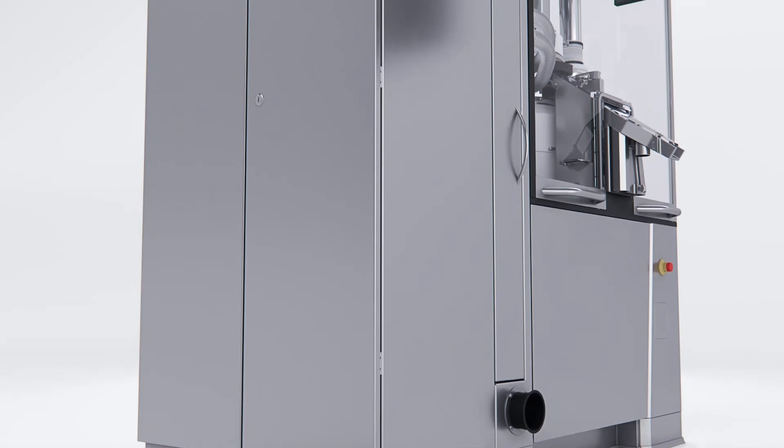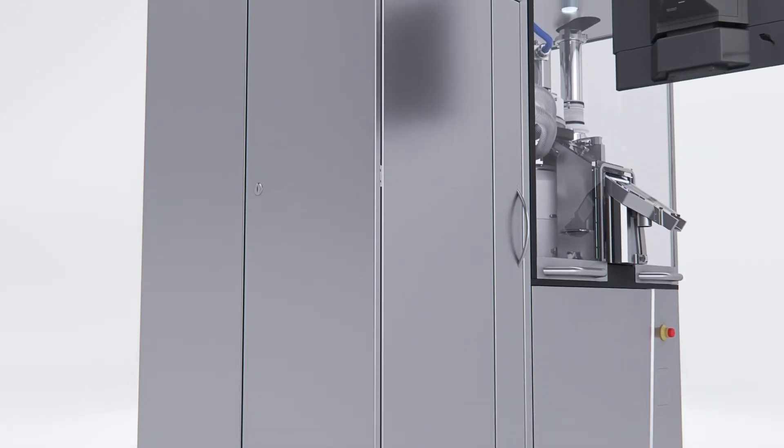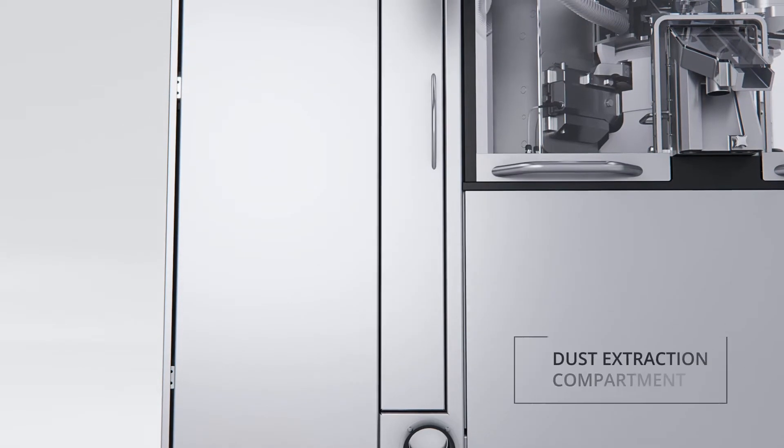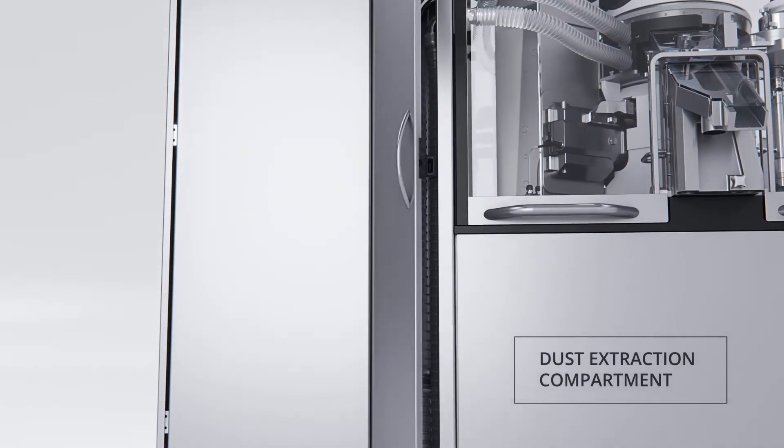At the rear of the machine, the multifunction column houses in two separate compartments the electrical cabinet and the main dust extraction connections.